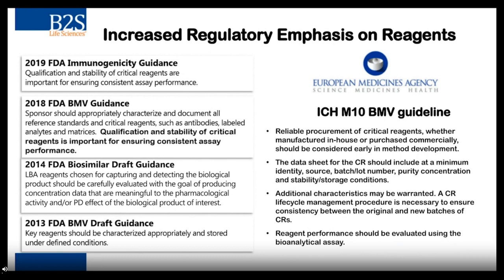In addition, over time, the FDA and the EMEA have both increased their awareness, requirements, and expectations around how we manage our critical reagents for supporting ligand binding assays. And as shown in this slide, there's verbiage around how those requirements have evolved over time.